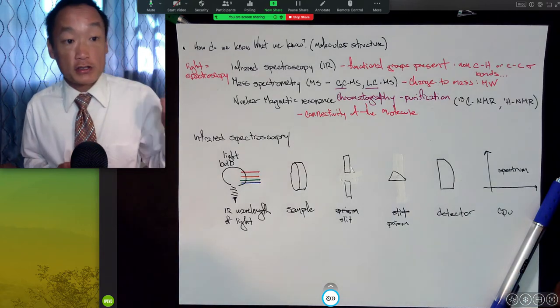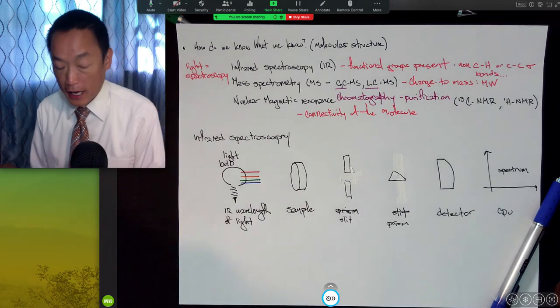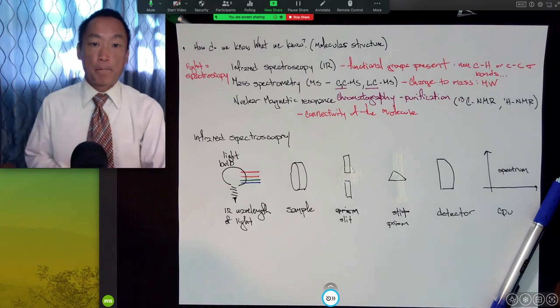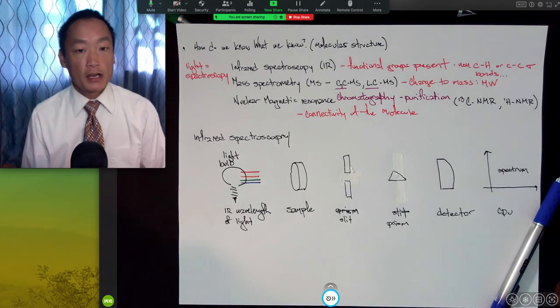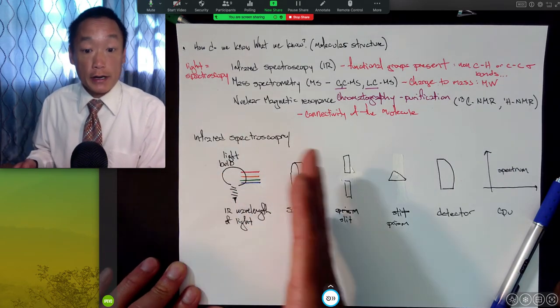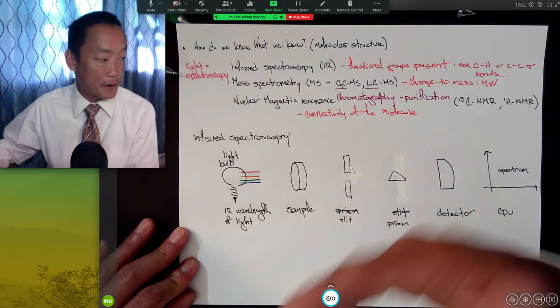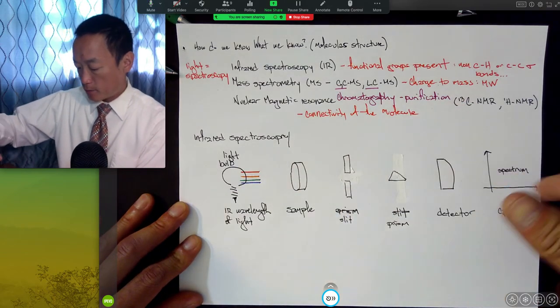The way we associate that is with color in our visible region, so I'll continue to use that right here. You turn on this instrument and boom, light turns on just like a light switch. All of a sudden, all these different colors of light are turned on and they interact with your sample. Let's take a look at what's happening with each one of these colors.